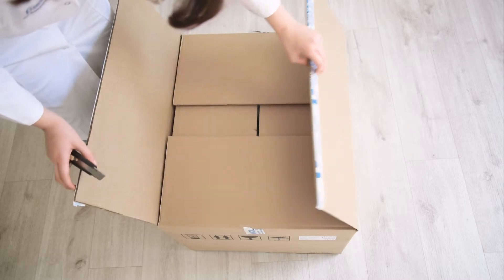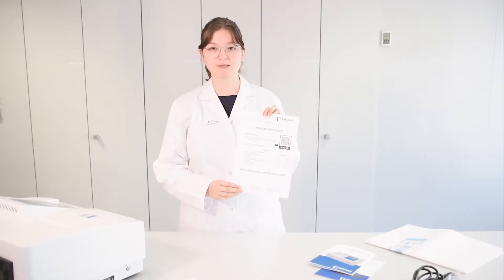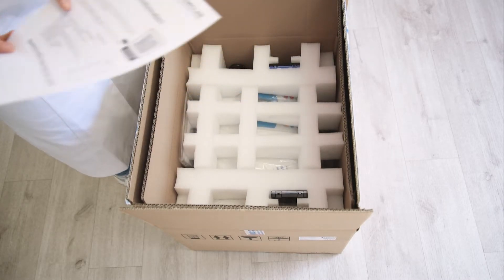First of all we have this checklist where you can tick off all the things that should be included in the package, and printed on this list is a QR code with which you can download the PC software and also the operating instructions.